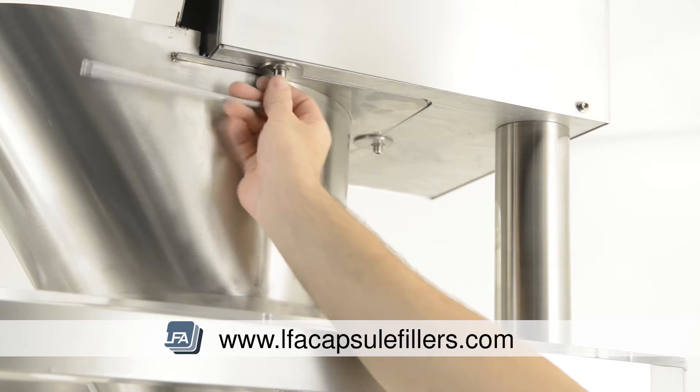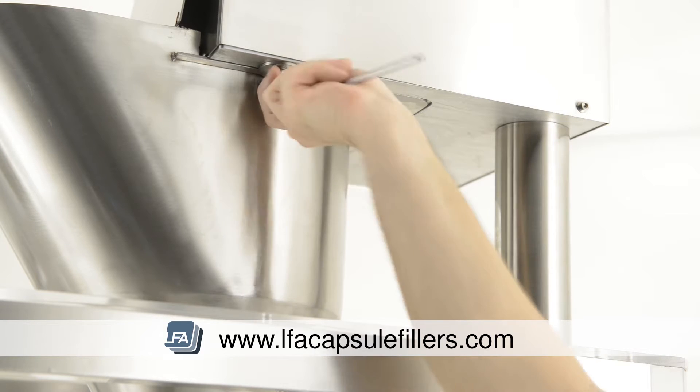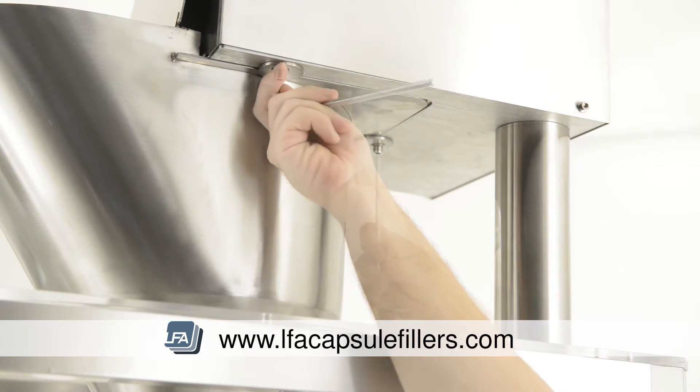Next, undo the three bolts on the underside of the top section, which will allow you to remove the top hopper. We suggest two people to do this to ensure the hopper does not fall.